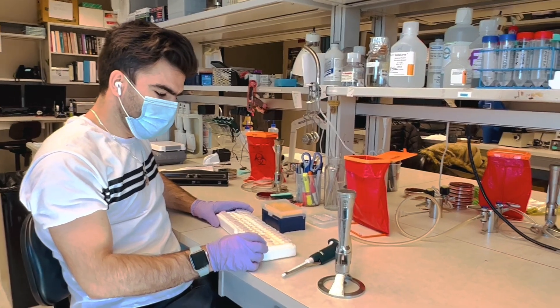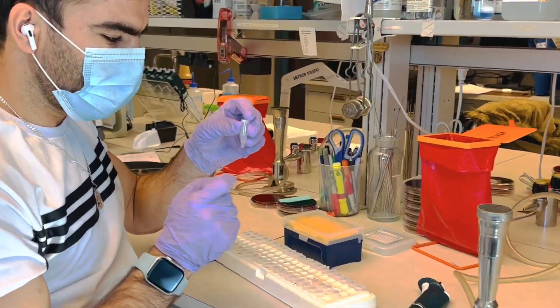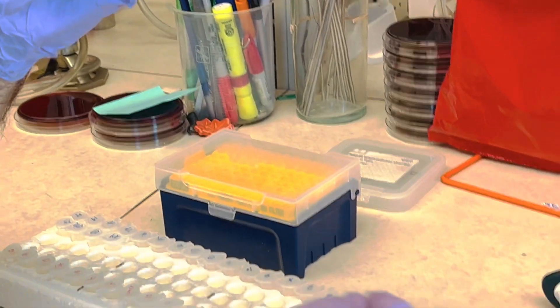The boiled lysate is ready. Now you can take the supernatant from the boiled lysate and transfer it to another tube with the corresponding label.